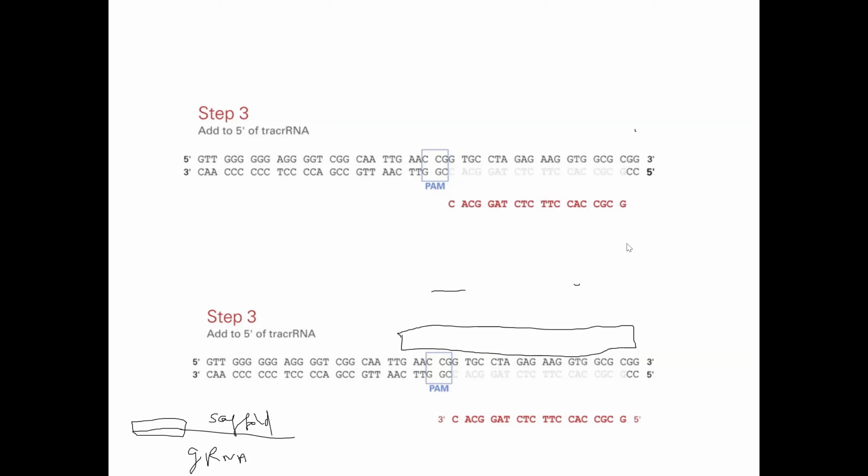and then you just take this, put 3', 5' here, and just invert that. Just reverse that. And this sequence will be grafted as the spacer sequence along the scaffold to form the guide RNA. So this is how one actually designs guide RNA.